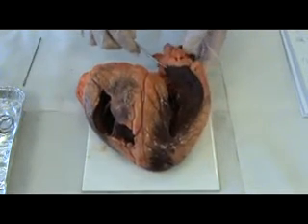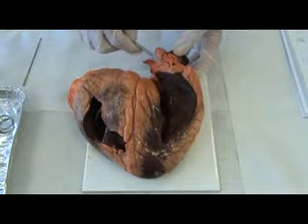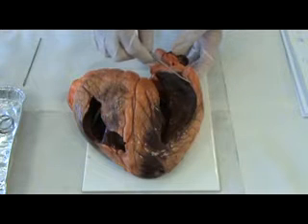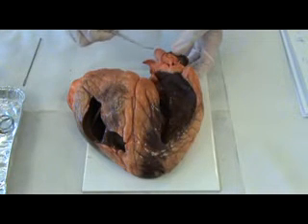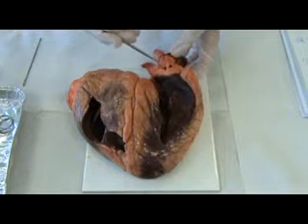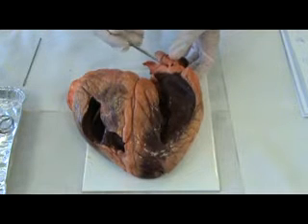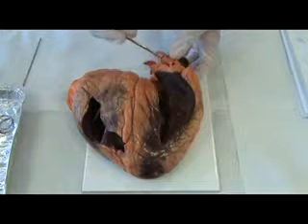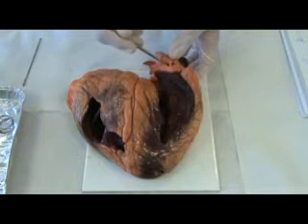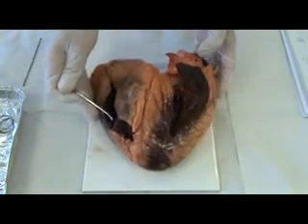If we have a look here at the heart that's been dissected for us, we can see how thick the fat is there. Especially there, it's very, very thick, isn't it? So much thicker at the top part of the heart. If you use the probe to move some of the fat aside, you can start seeing some blood vessels there. These are the branches of the coronary artery. This is the left side of the heart, so these would be the left coronary arteries. This would be the right side of the heart.